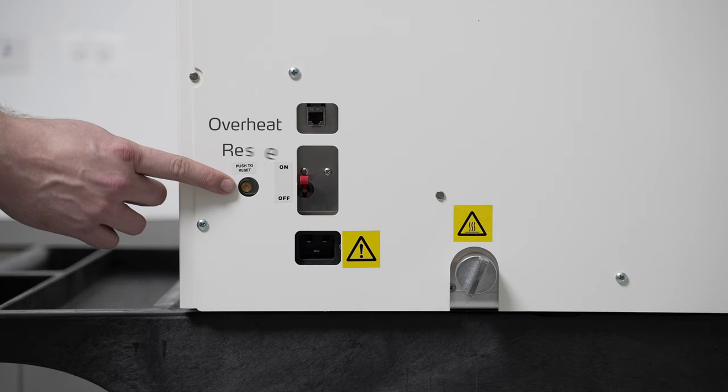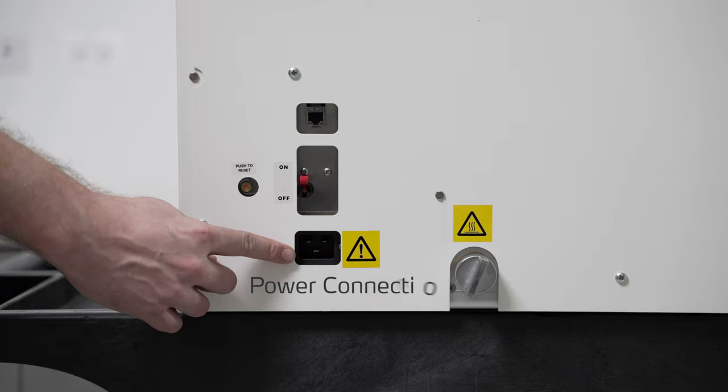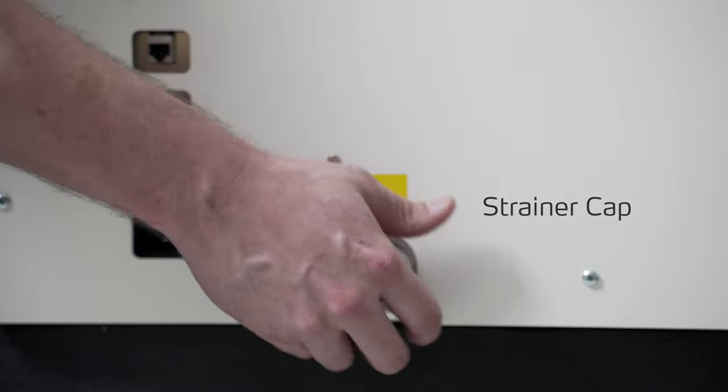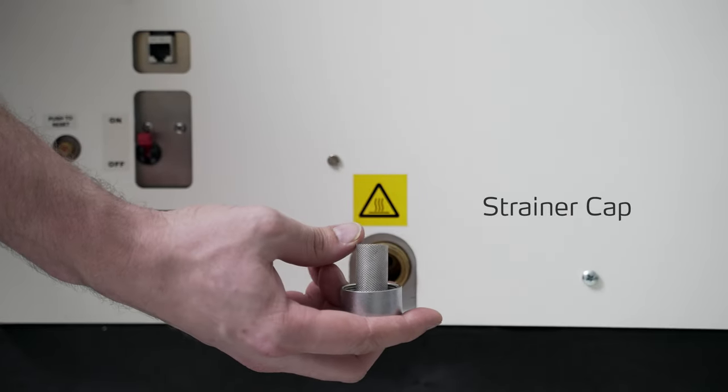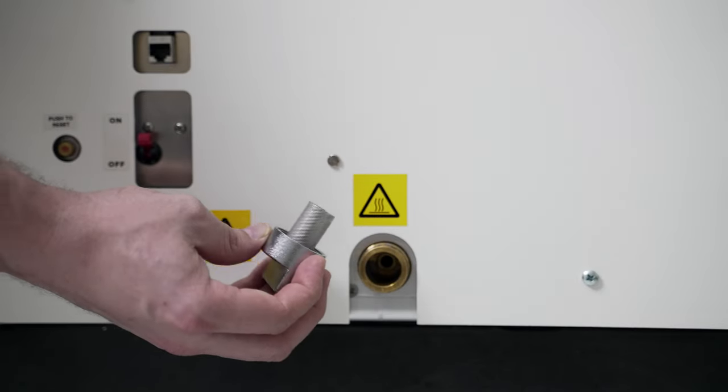To the left of that we have the overheat reset cutout. At the very bottom here we have the power cord connection. And this silver cap here is the strainer cap — inside is the strainer mesh designed to catch any solids from spilled media and stop it from getting into the internal plumbing of the system.